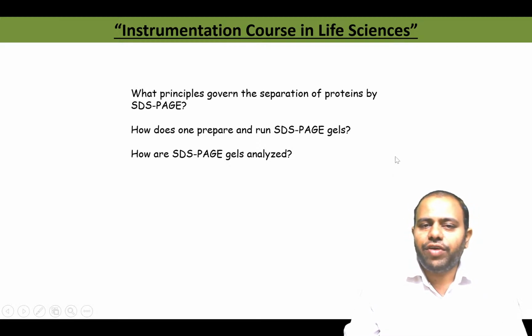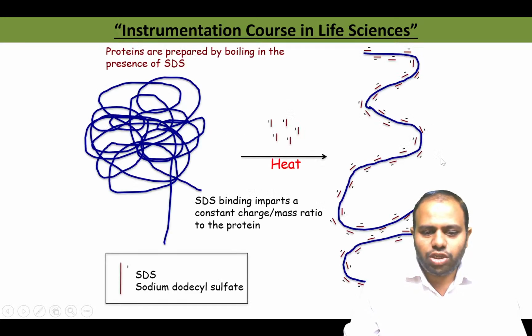Two of the stains that we are going to discuss in today's video are Coomassie Brilliant Blue stain and silver staining. So we are going to see these two things.